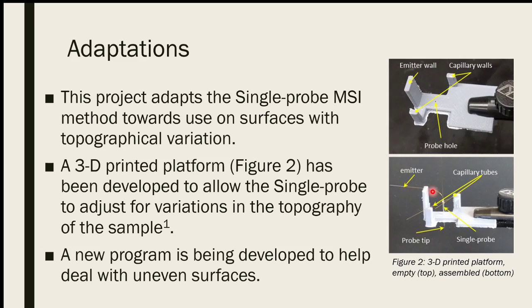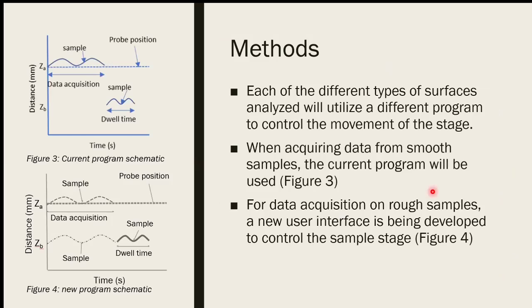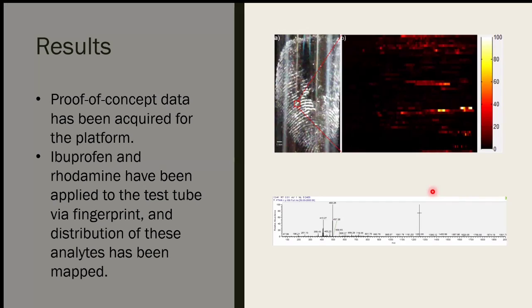Yeah. So how do you average, like when you do the imaging scan that you had, do you go over the same area multiple times, or is it like a once through? So, I wish I had an image of that here. I'll make sure to put that in next time I make one of these. Okay. But I guess I'll have to go with this. Here you'll see, this area gets divided up into 50 lines.